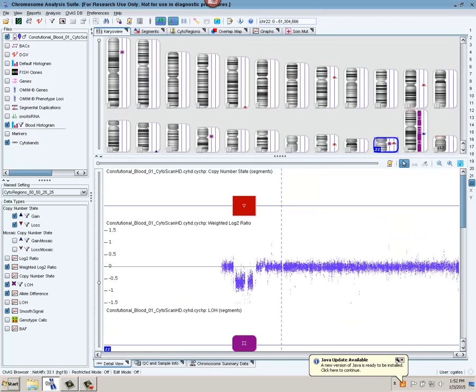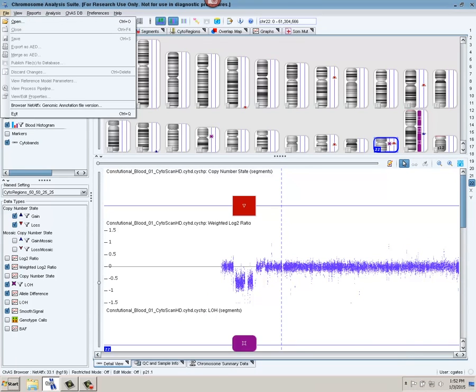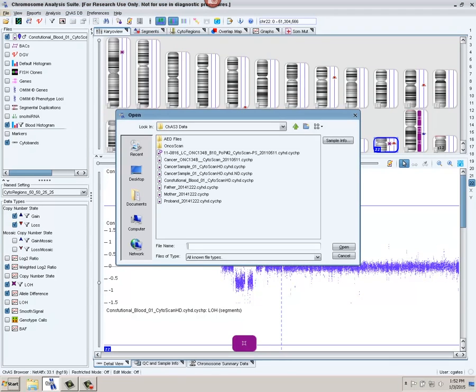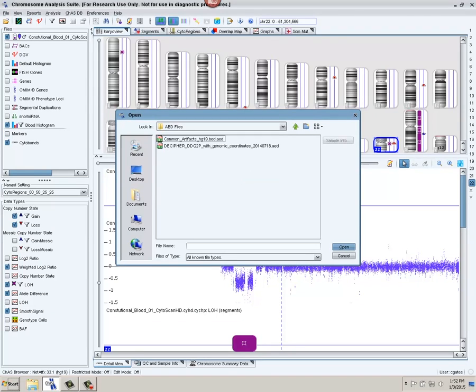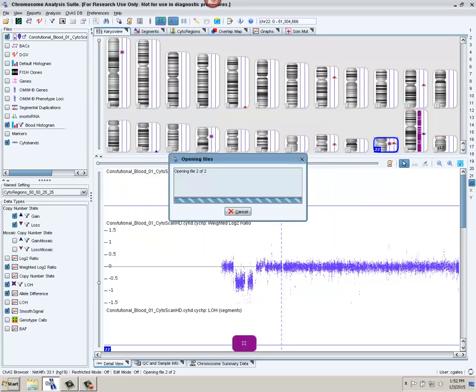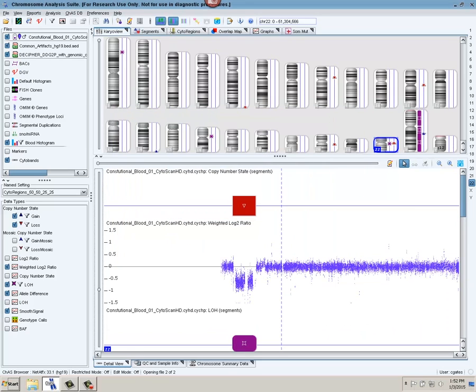Then we are going to go through and, using the same File Open, load two AED files. These are Affymetrix's version of a BED file, which contain cytoregions that we're interested in that are clinically relevant, and the other will be regions that are known to be artifactual throughout the genome.